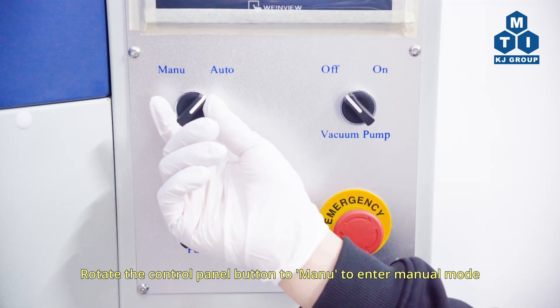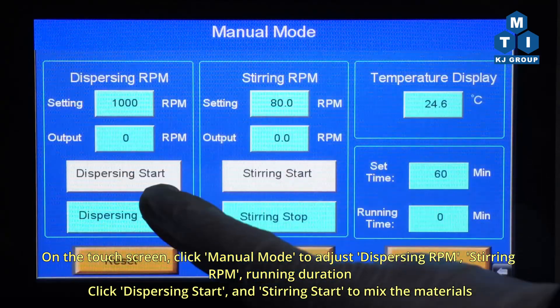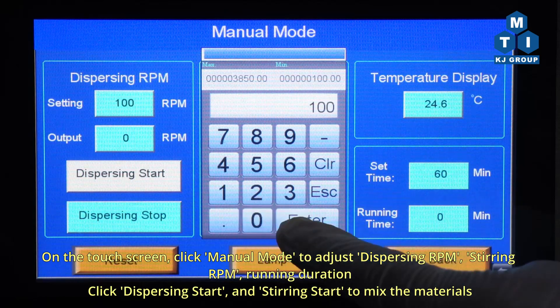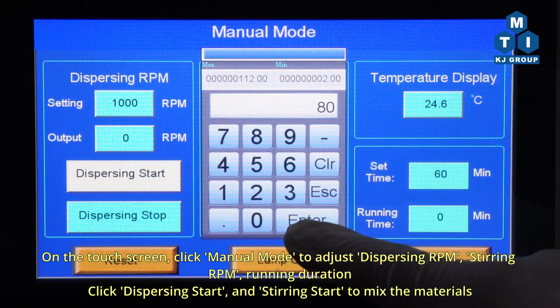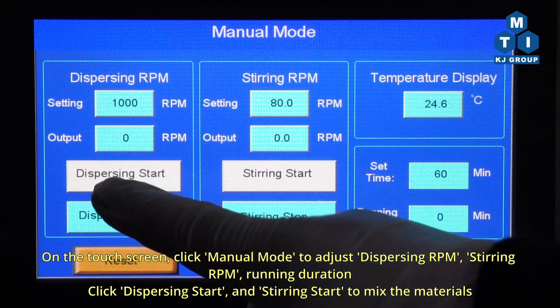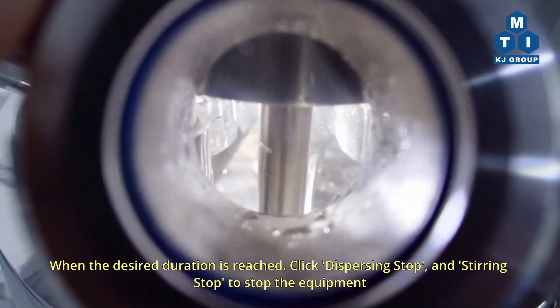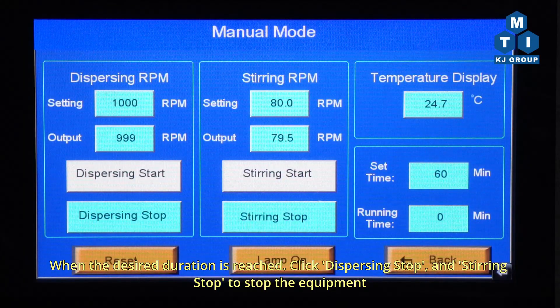Rotate the control panel button to Manu to enter manual mode. On the touchscreen, click Manual mode to adjust the dispersing RPM, stirring RPM, and running duration. When the desired duration is reached, click Dispersing Stop and Stirring Stop to stop the equipment.